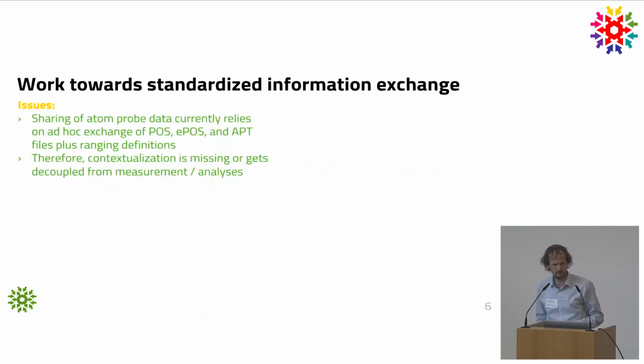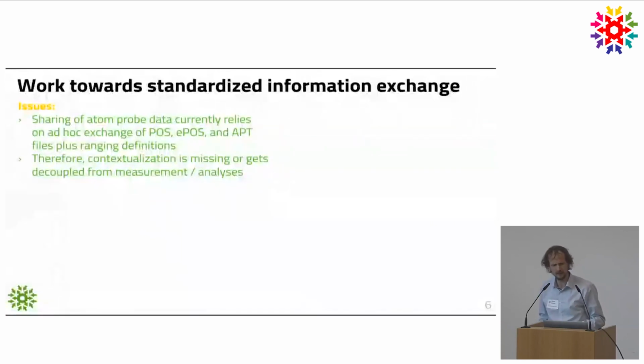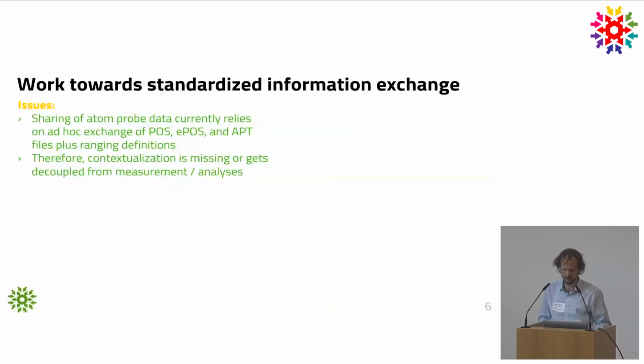Then we also worked on standardizing information exchange. That goes basically to try to move away from these binary tables lacking context towards something which in fact matches the entire concept that we developed in NOMAD. Here specifically this NeXus application definition idea, where you compose from various sources of information, the ELN, the commercial vendor files, and ranging definition files. You put the information together into a consistent data artifact that you can either use as is, without NOMAD, without being interested in anything of what we're doing, and just share it with your colleague. And you would already be much more informed than if you were to share a POS file.